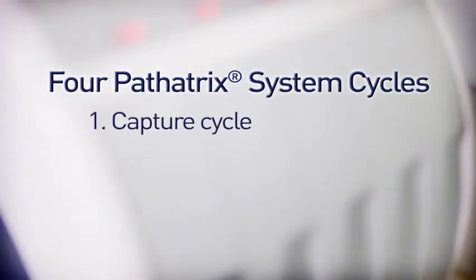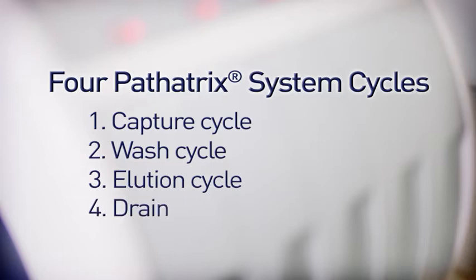The Pathatrix system is completely automated. The system goes through four cycles and we'll go into those in a bit more detail as we show you how the unit works.